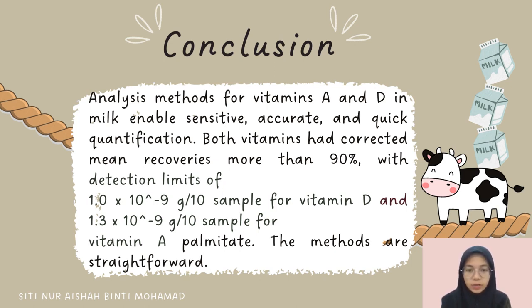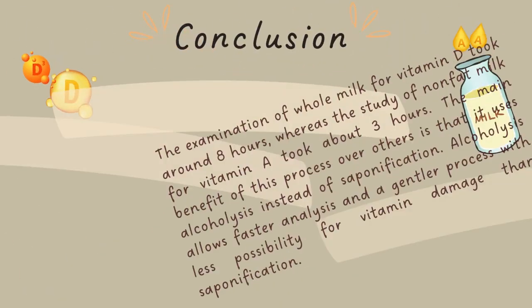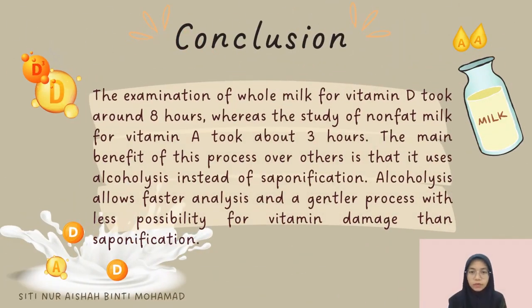The methods are straightforward. The examination of whole milk for vitamin D took around 8 hours, whereas the study of non-fat milk for vitamin A took about 3 hours.